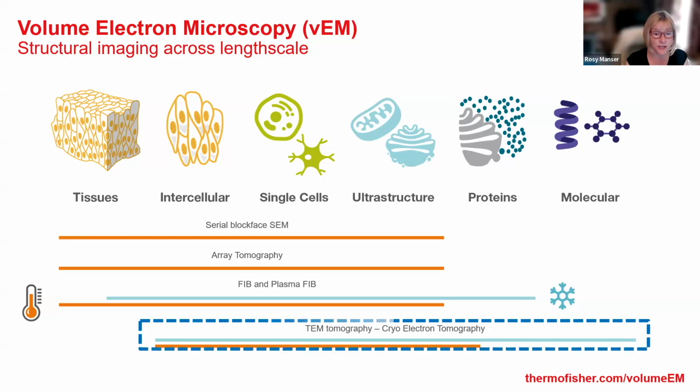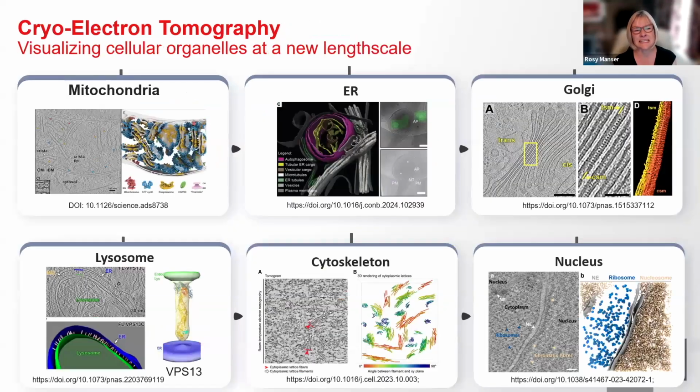And for today, it's the cryo side of tomography that I'm focusing on. You can also do TEM tomography on non-cryo specimens. It doesn't quite get you to the same level of resolution, but it's really the cryo stuff that I'm going to focus on today. And as I said, it's been the last 15 years where this technique has begun to have a real hold in the biological community.